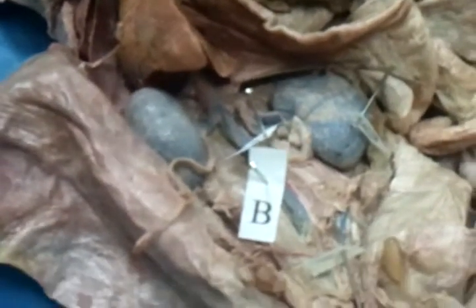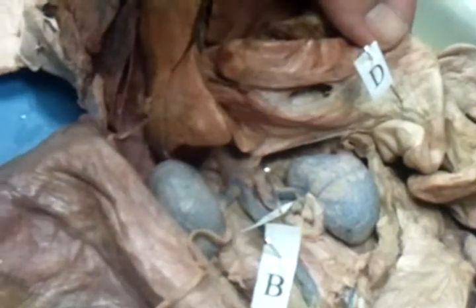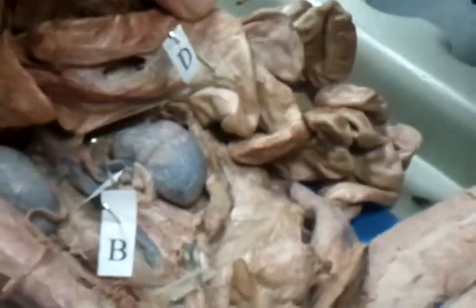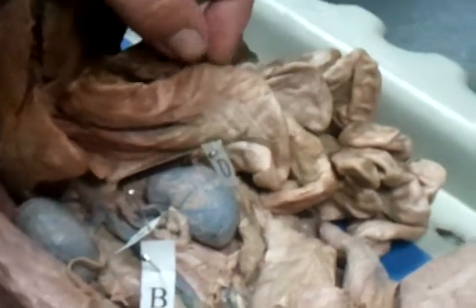What about D? Okay, what is that? Ascending. No. Look at where the pin is and what that material looks like. Duodenum. Mesentery? No, what is the pancreas? It's the pancreas. I think it's pinned stupidly. I would pin it up there. Oh, that's the duodenum then.